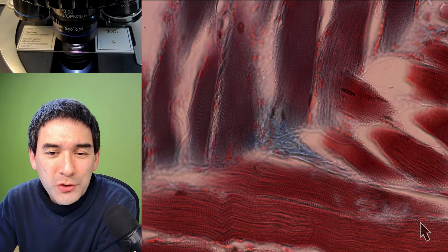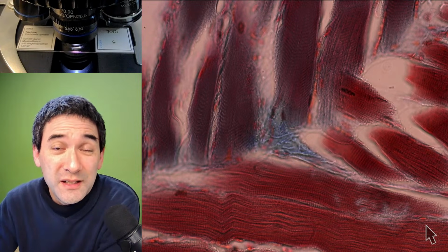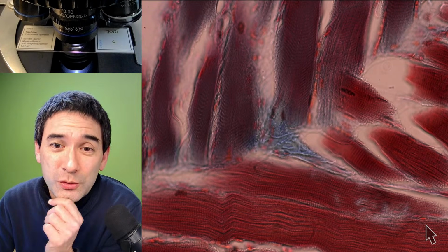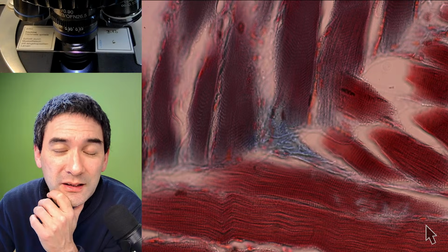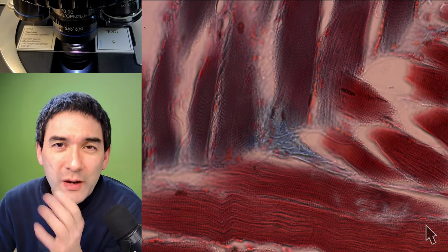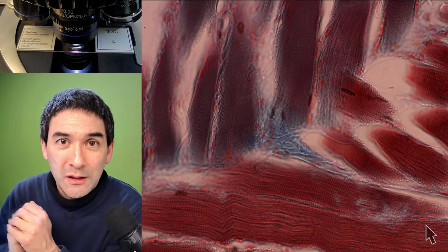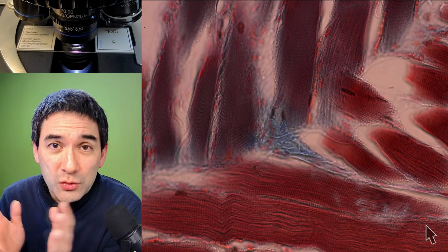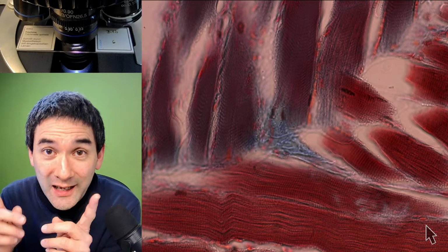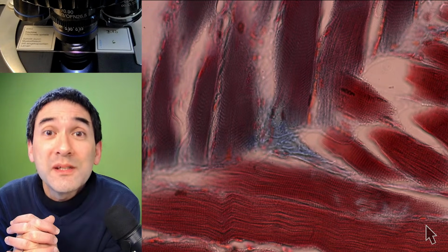And the early microscopists, when they first saw those, of course, they didn't know what it is, but they realized one thing, and that's quite interesting. And I found the original publication somewhere. They realized, isn't this kind of strange? You find those striations in the meat of a whale, the largest animal, and also in tiny insects. You find those striations, those stripes. And that's the interesting realization: they have the same size.